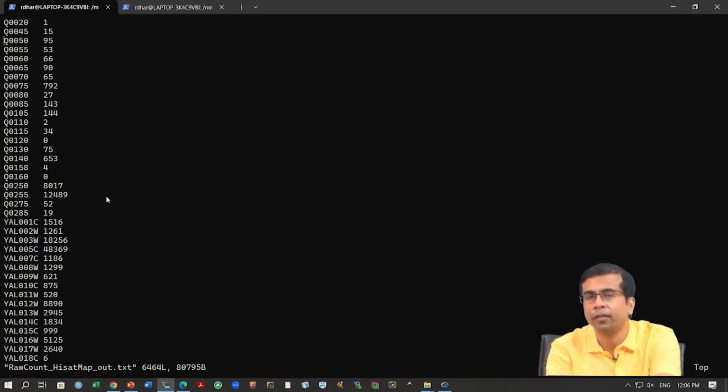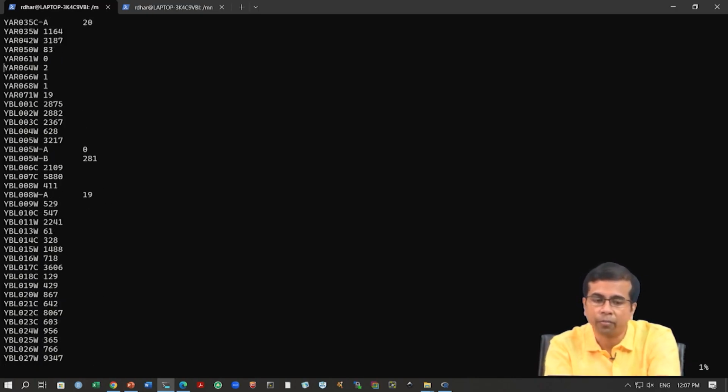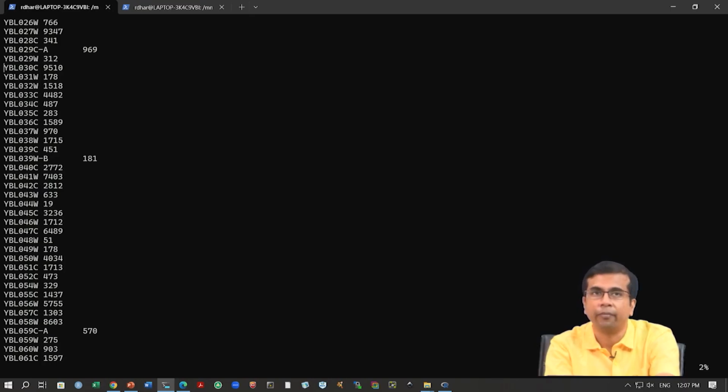And because you have so much data, you can be sure these genes are probably not expressed or have very low expression. But for most genes you have expression; you can see some read counts, and this is the raw read count. This is a very important step for all subsequent data analysis. Hopefully it is clear how we simply generate this kind of raw count data from the mapping using a tool like htseq-count.